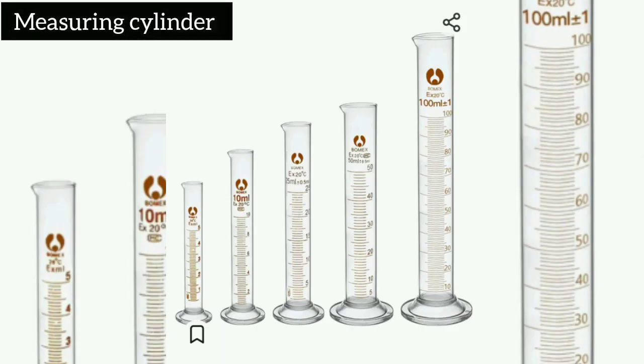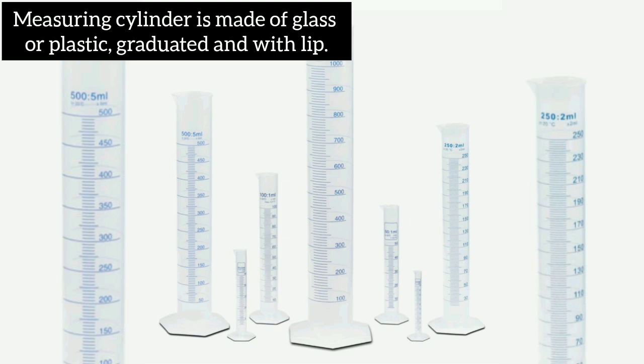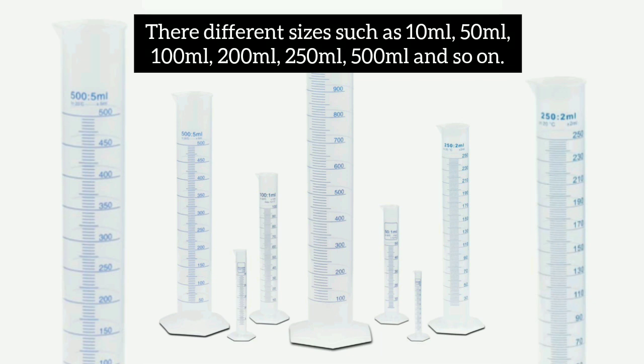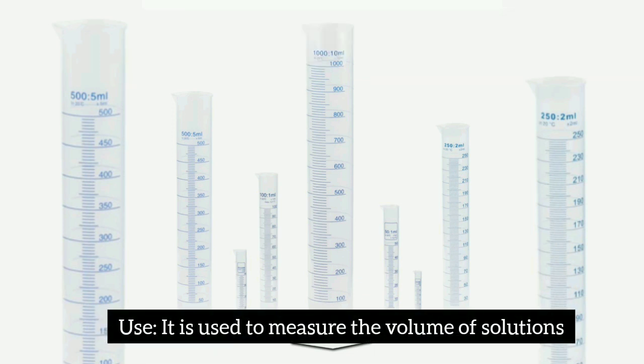Number 4, measuring cylinders. Measuring cylinder is made up of glass or plastic, graduated, and with lip. There are different sizes such as 10 ml, 50 ml, 100 ml, 500 ml, 1000 ml, and so on. Let's look at the use. It is used to measure the volume of solution.